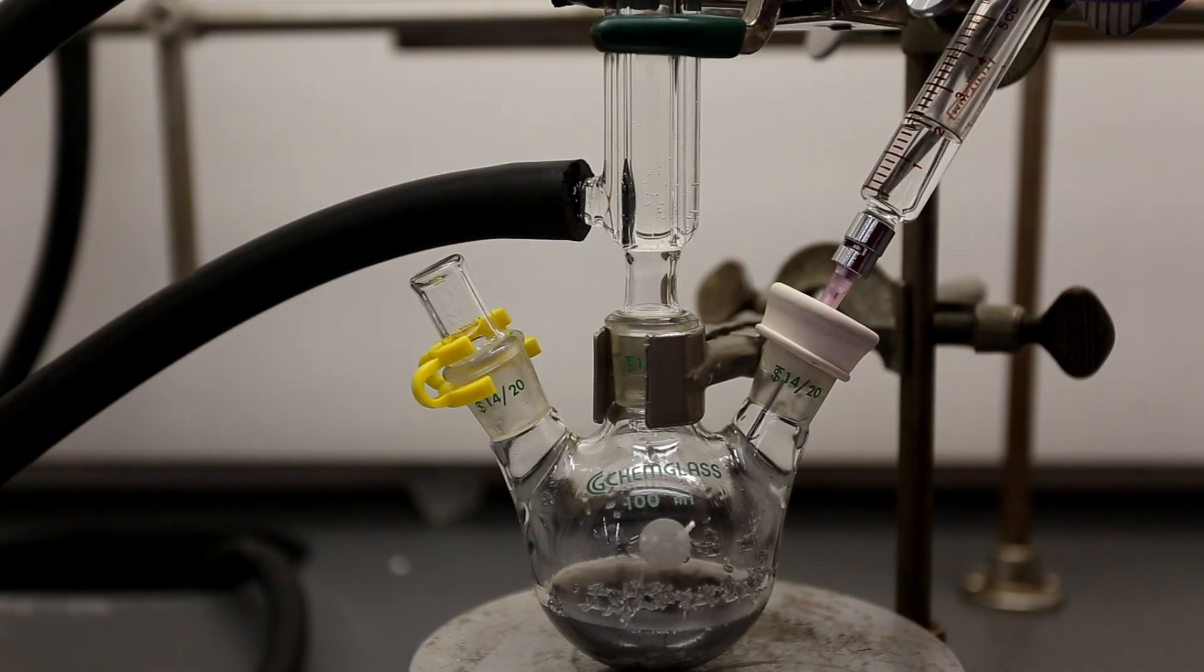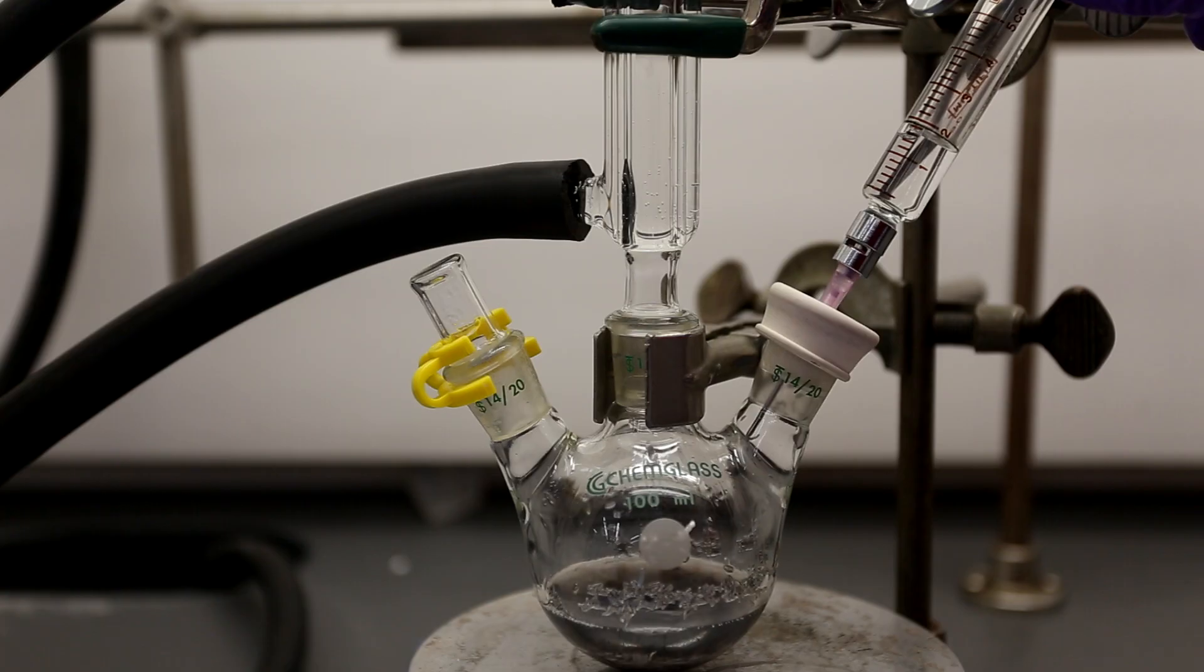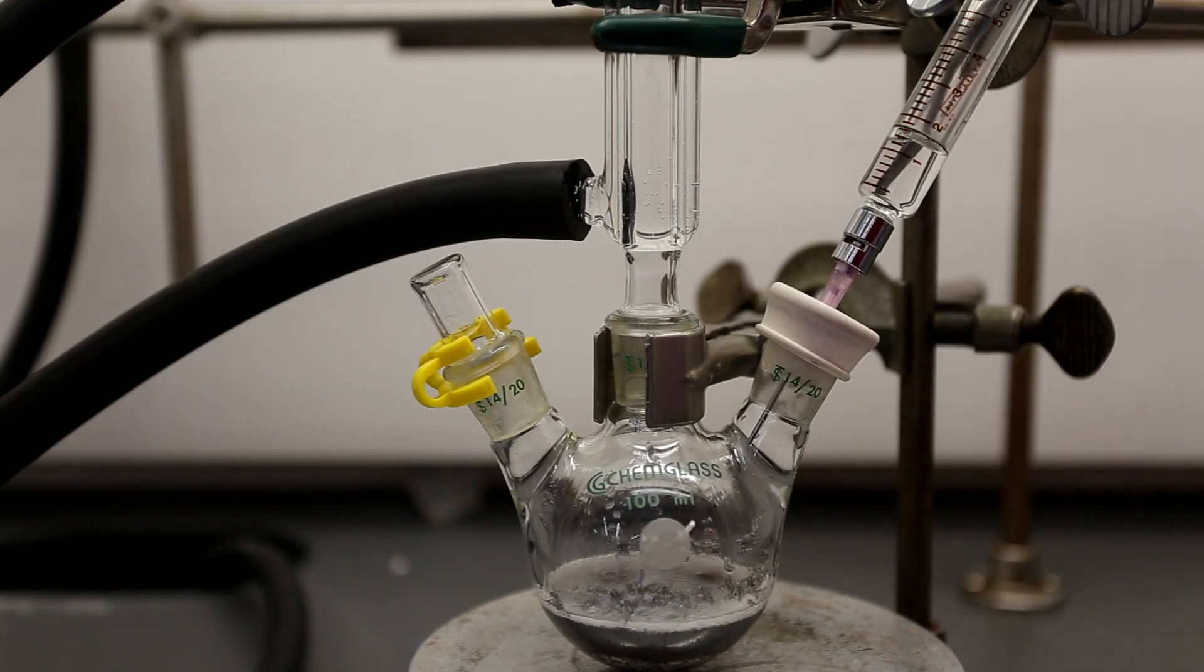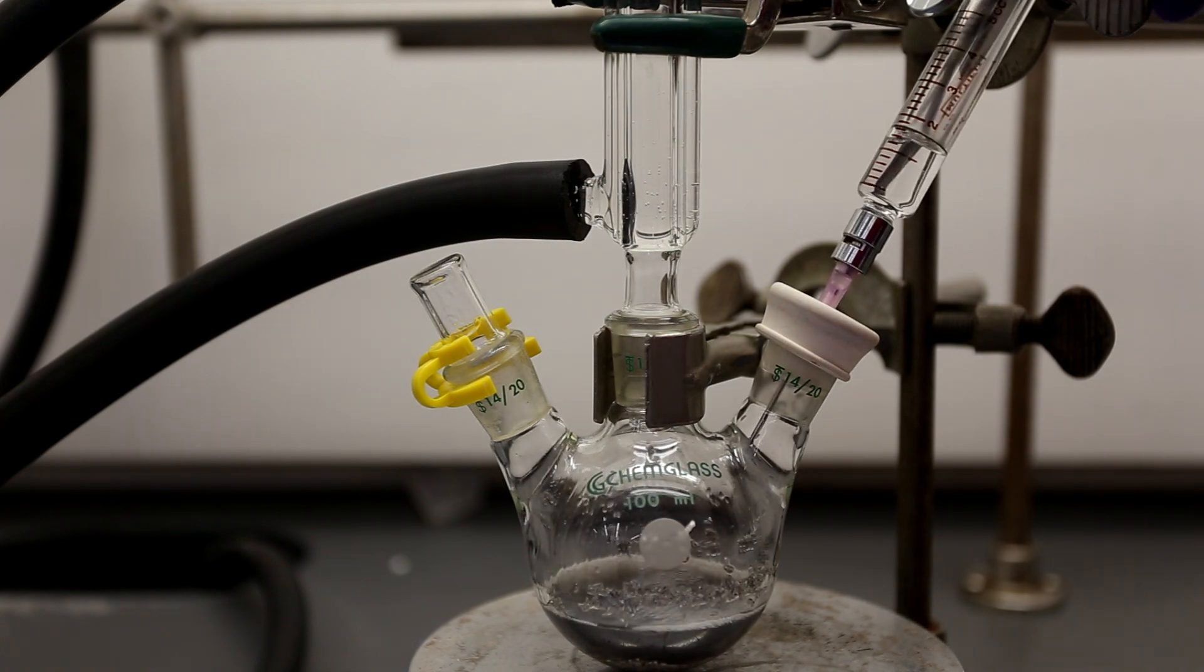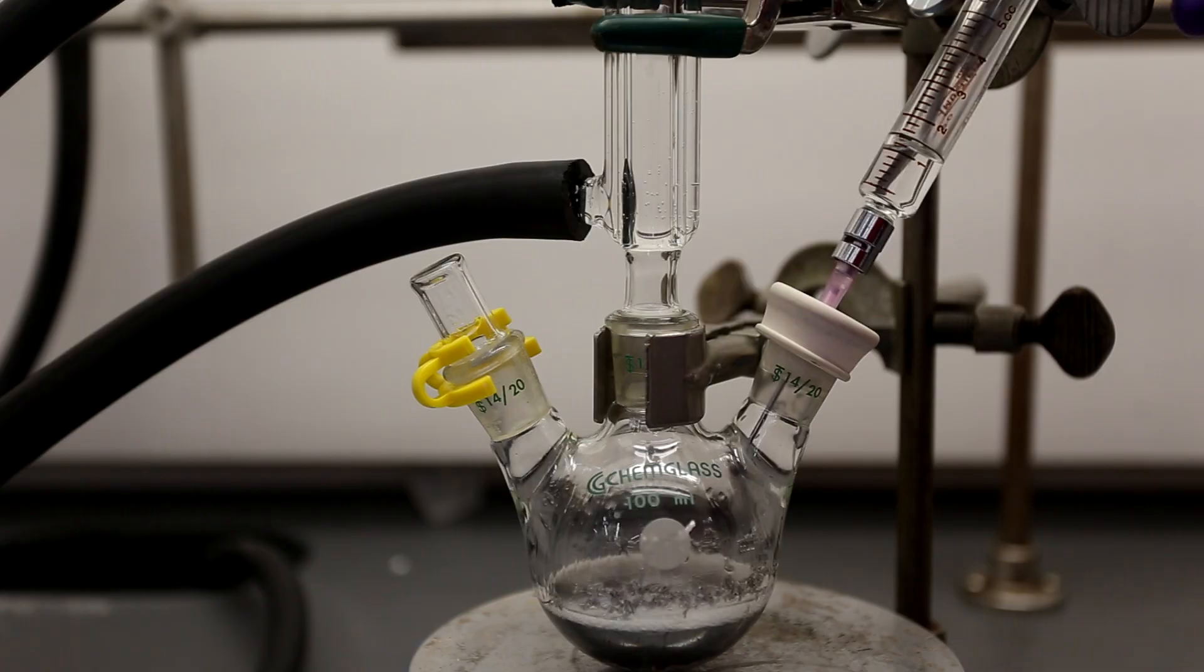As the reaction progresses, I keep injecting ether in order to try to maintain a constant volume. If you use a very cold condenser column, you probably don't have to do this, but since I'm just using tap water, a lot of the ether was lost out the top.